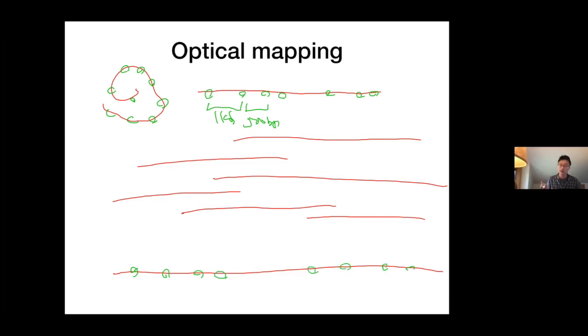And you can do in silico cut of your assembly, and then map your assemblies back to this genome map. So if this is your assembly, it has the same cut site here. This is another assembly, another contig that has the same cut sites, and so on. So you know, counting A, B, C, orient them by this order, and you can then try to fill gaps in between, right? Okay, so that's the idea of optical mapping.